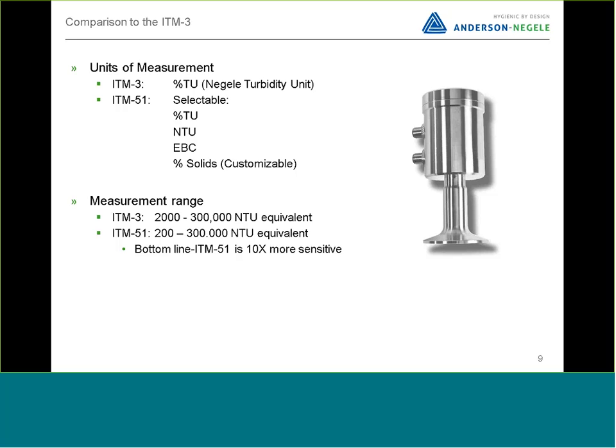But it also can be configured to read out an NTU or EBC equivalent or percent solids. So if you have mapping between NTU and percent solids for your product, and it's desirable for you to have percent solids output by this device, you can enter in the points on the curve to identify a solids curve in relation to NTU measurement. That's customizable within the software.